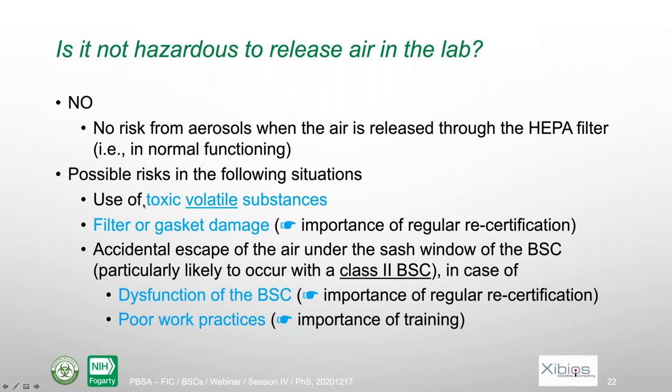The first one: if you use toxic substances that are volatile, those are likely to pass through the HEPA filters. It's not a biological risk, it's a chemical risk. Also, there could be some biological risk if the filter or the gasket of the filter are damaged. In that case, of course, you need to change the filter or make a new gasket. And that stresses the importance of regular recertification.